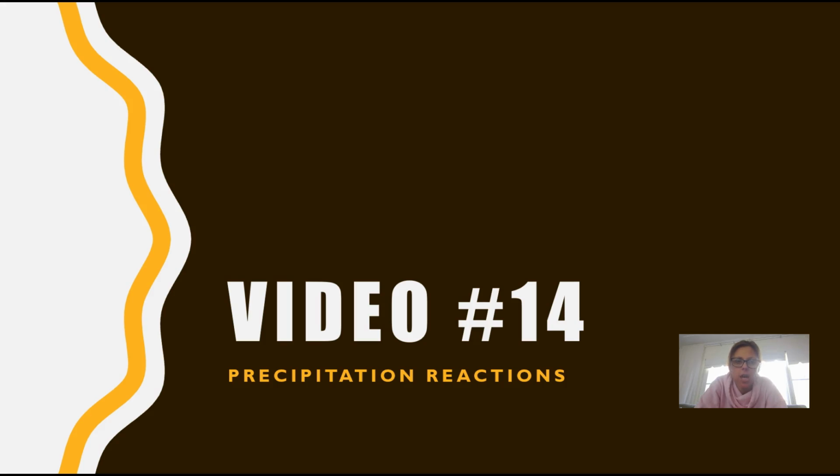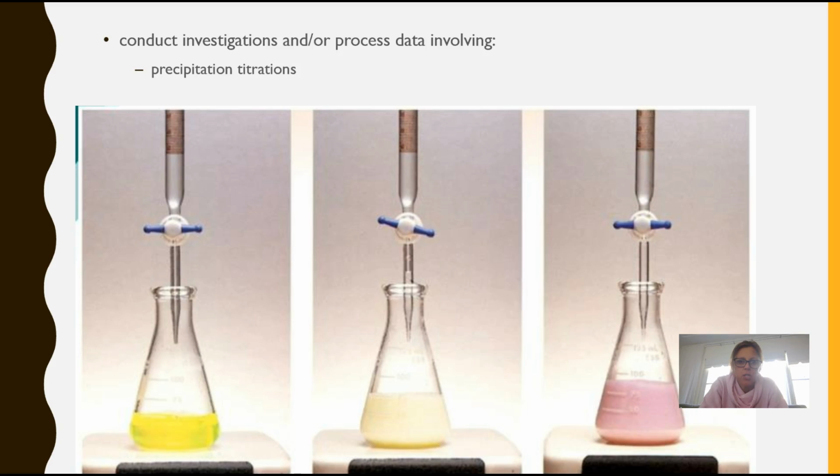We've got the end in sight and we're nearly there, and this is the last part of module 2 that we're going to cover, as we've already covered the earlier bits. And what we're looking at today is precipitation titration. So you'll remember with our gravimetric analysis, it said conduct investigations and/or process data involving precipitation titrations.